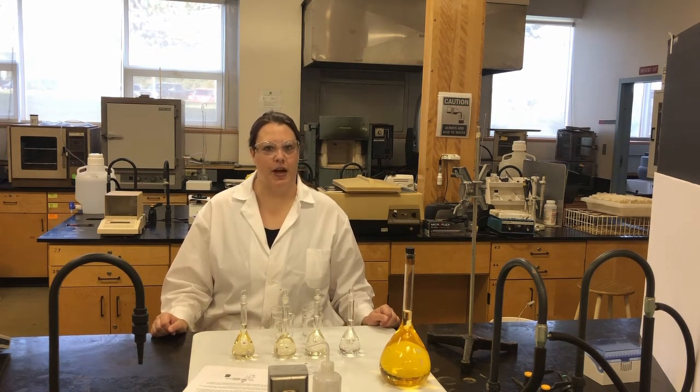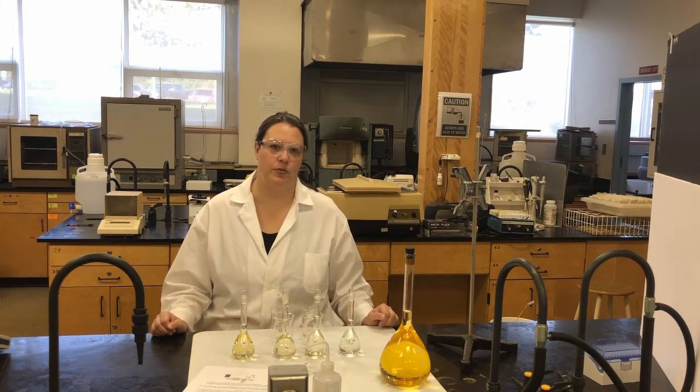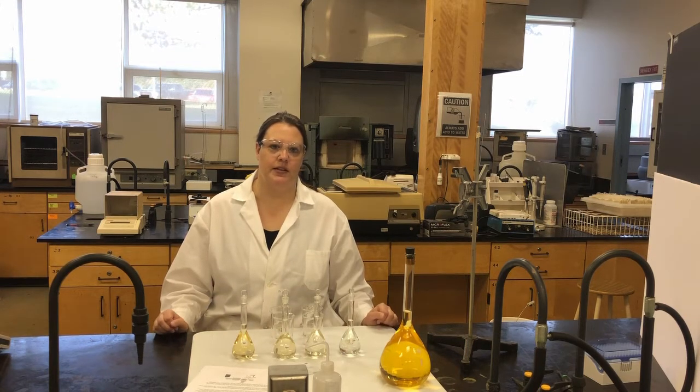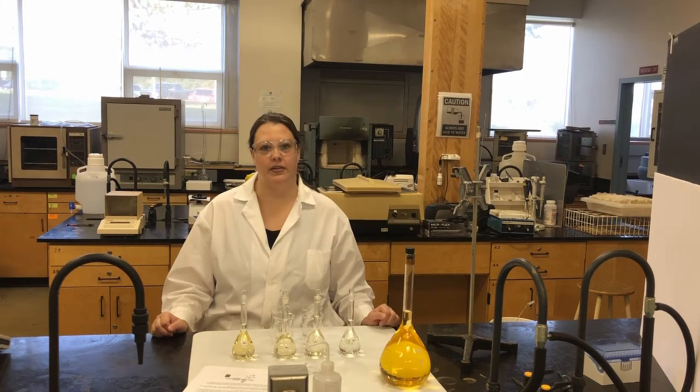It's usually a very rapid technique, depending on the sample prep that's involved. Some samples will require more prep than others. For water samples, which is what we're going to do today, it's a fairly efficient method. So it's very useful and has a lot of applications in environmental chemical analysis.